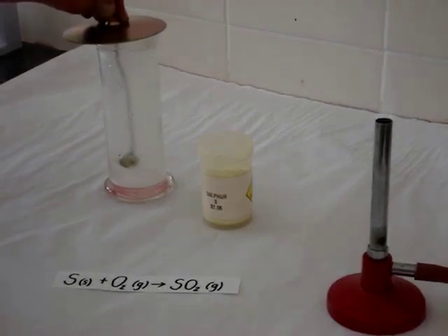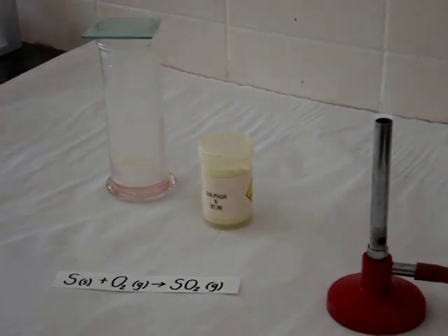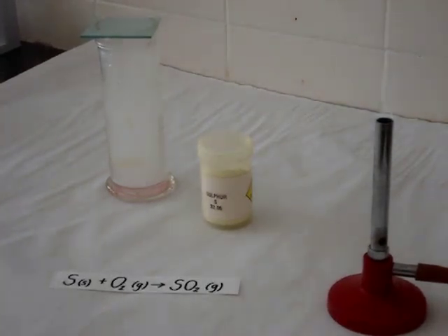And sulfurous acid is what forms acid rain. We could test that it is indeed acidic by adding a little bit of indicator — a universal indicator would turn reddish.